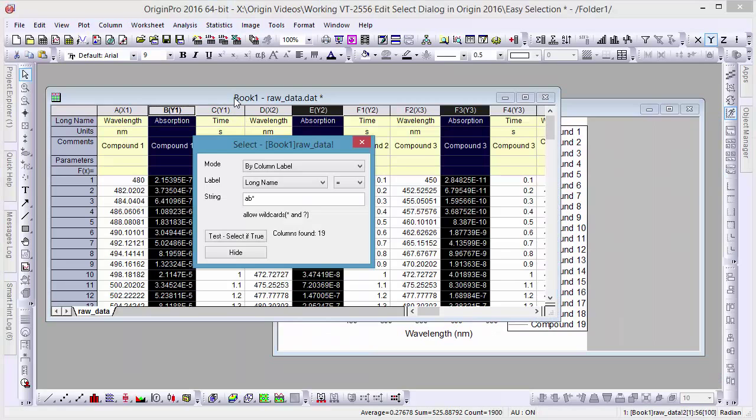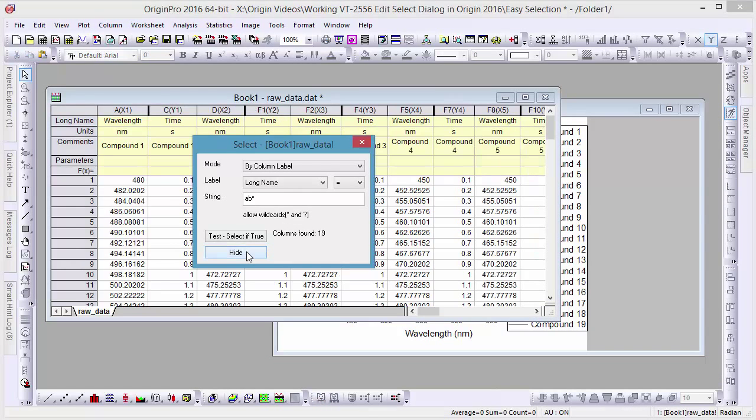What's more, we can use the Hide button if we decide that we want to hide the same values from our worksheet to view other data.